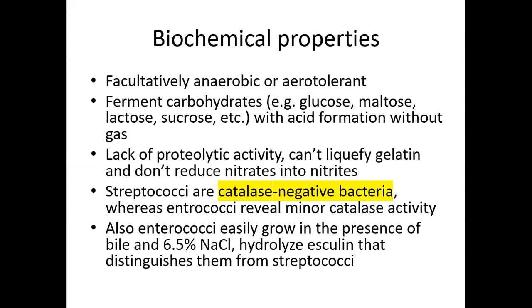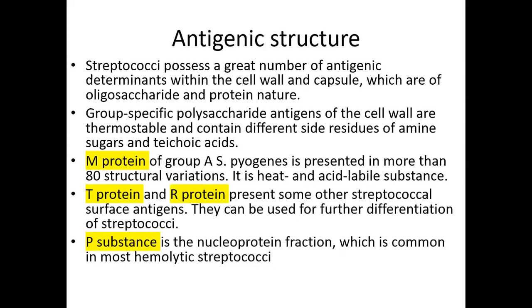Streptococci are also catalase negative bacteria, while Staphylococci are catalase positive. But Enterococci reveal minor catalase activity. Also, Enterococci easily grow in the presence of bile and 6.5% sodium chloride, and hydrolyze esculin, which distinguishes them from Streptococci.